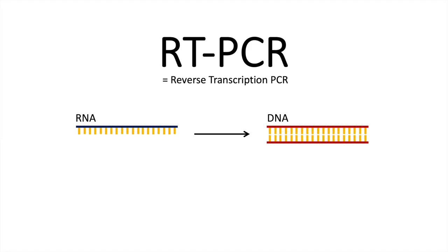We apply Reverse Transcription PCR when we have an RNA fragment and we want to transform it into DNA so that we can amplify it to sequence it. This is, for example, applied when we have to check if a person is infected by a virus. Since many viruses contain RNA, we first have to extract the RNA and with reverse transcription generate DNA, and then we can amplify the DNA with PCR. We use reverse transcription PCR, for example, nowadays in the 2020 COVID-19 coronavirus, when we test patients whether they are infected with the virus or not.